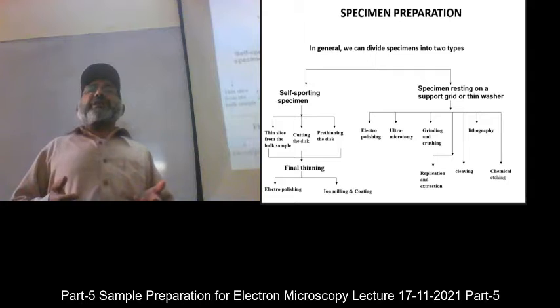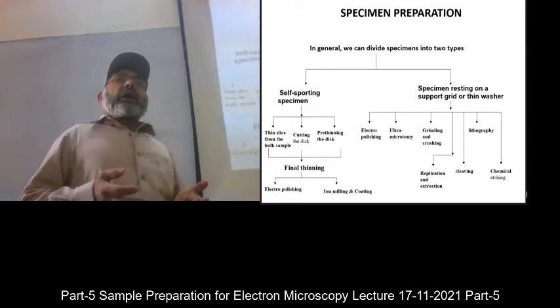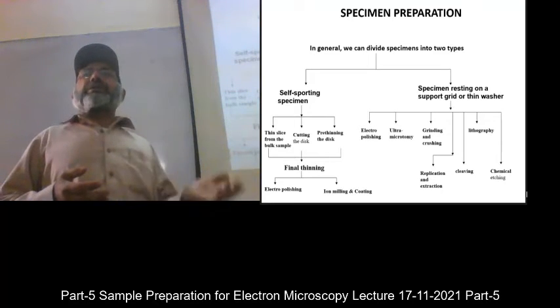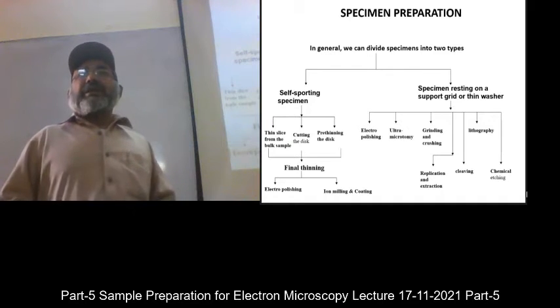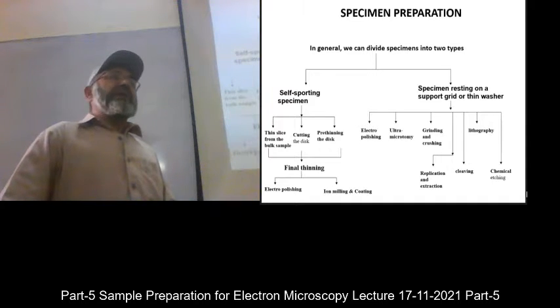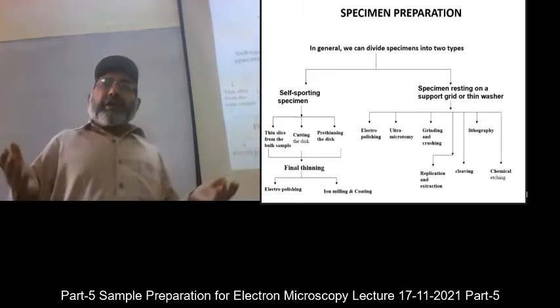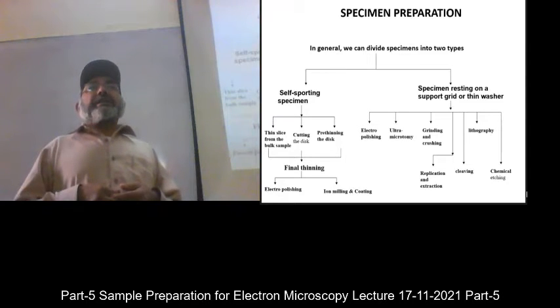It is basically the specimen preparation which decides about the nature, about the composition, about the phase constitution, which phases are present in a specific material. These all depend upon the specimen preparation. Are you skilled enough to prepare the required specimen for that particular technique?